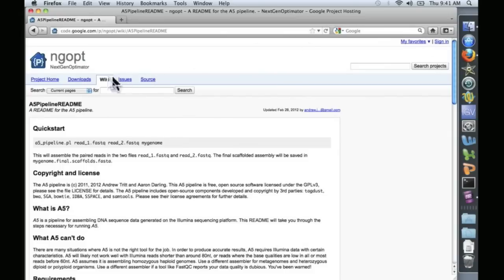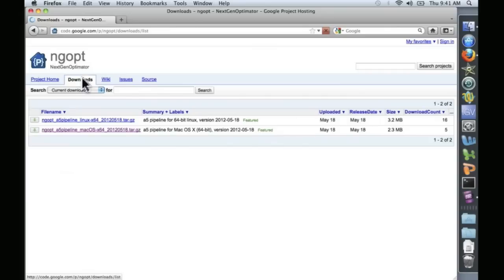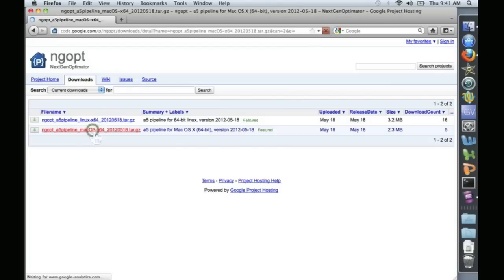And up here at the top, under Downloads, there are two versions available. There's the Linux and the Mac OS version. We'll download the Mac version.